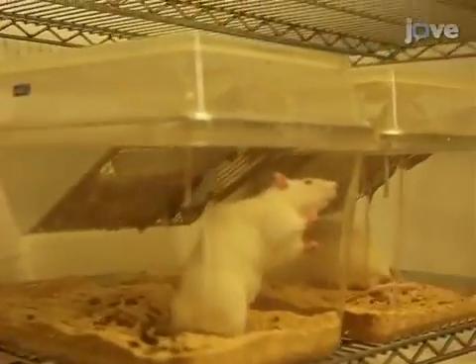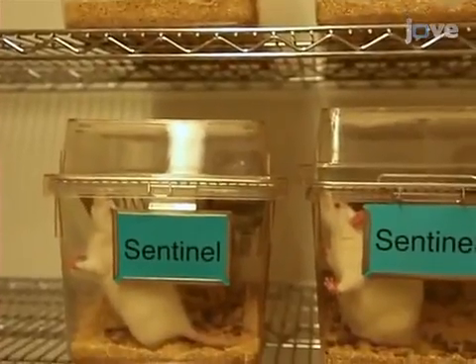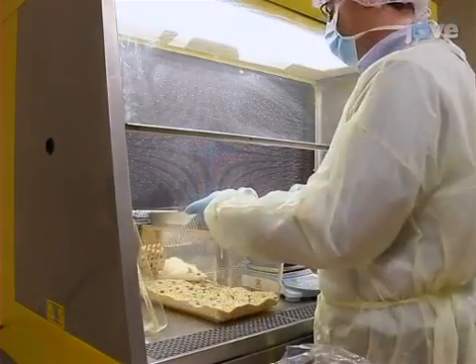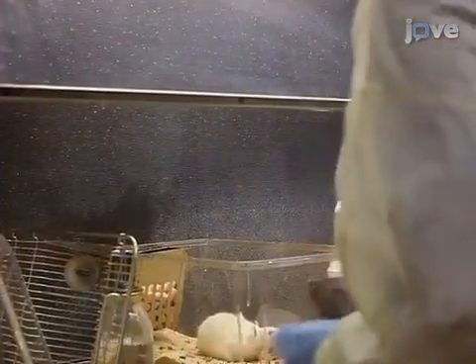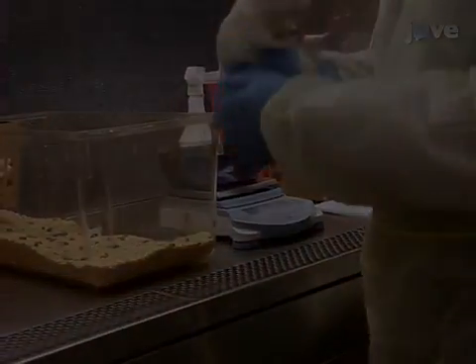For the following protocol, male Sprague-Dawley rats are singly housed and kept on a 12-hour light-dark cycle. Fill the food hopper with a low-fat food and habituate the rats to the food and colony room for at least 7 days prior to experimentation. For each of the 3 days before taking baseline measurements, handle each test animal to reduce stress.